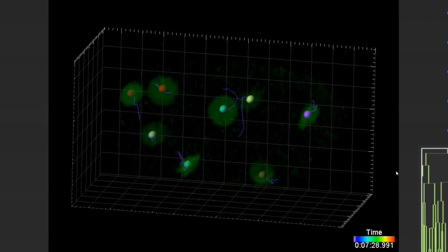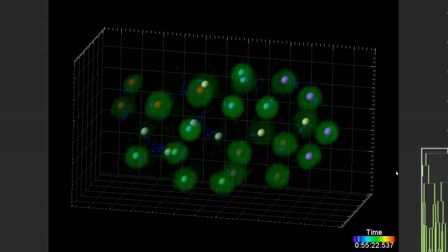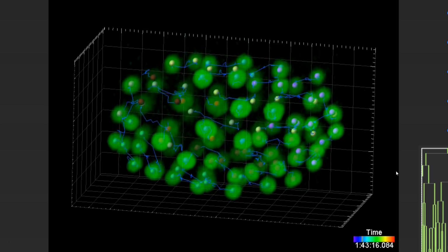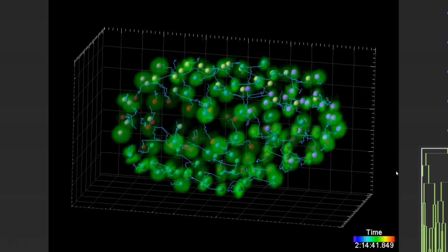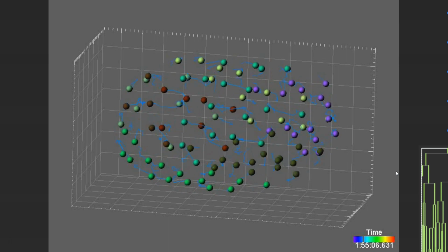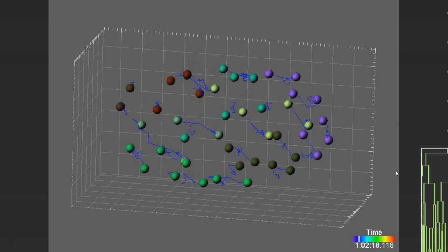elegans embryo where I've used a spot detection. The little lines are showing you the trajectories, the little movement, and as those cells divide, you can see the little branch occur in the track. Also, we have a new labeling feature that allows you to label different cells in different colors, so when they divide, they retain the same color as the mother, so you can take a look at things like cell fate. So when you're looking to see where they go after they divide, it's a little easier to visualize when they're color-coded with a label.